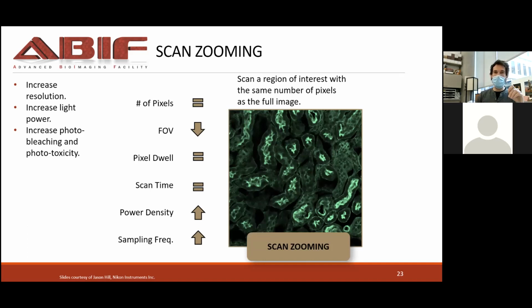And so it's important to have an idea of how you can play around with this geometry of scanning, both in terms of the dwell time, the number of pixels, and also how you can modulate the size and the geometrical aspects of your scanning as you want. On the confocal, you have much more flexibility than you do on a camera-based system, but you have to really have an idea of what you're doing and how it might be advantageous to your imaging.